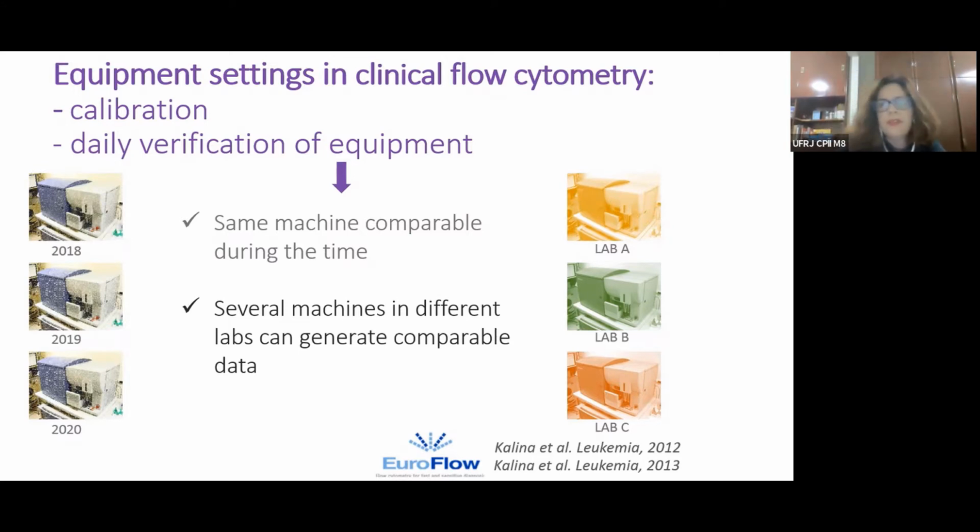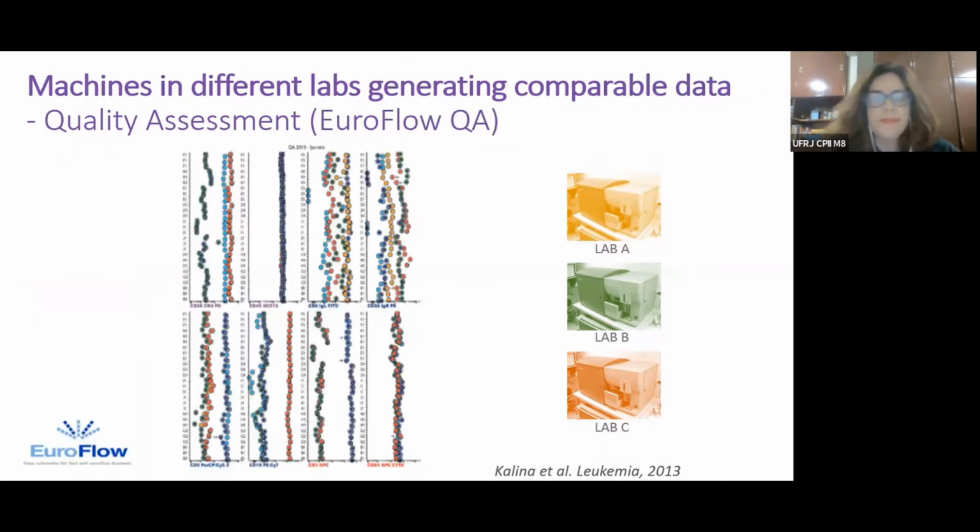We worked, for instance, with a center in Jaú, in São Paulo, and they use the same SOPs and the same panel for MRD detection, and we can compare the MRD before and after the bone marrow transplantation in different centers, and the data is fully comparable.